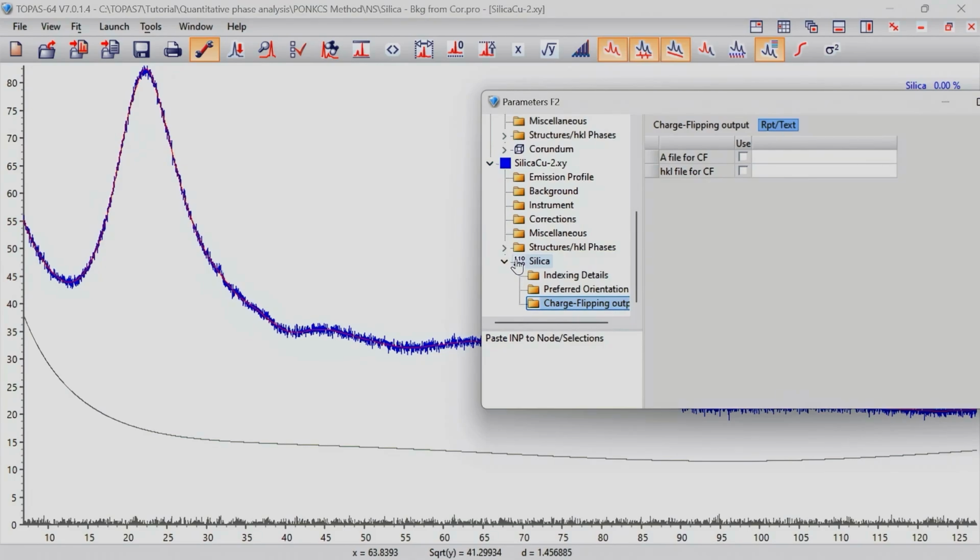Personally, I use only Pawley refinements because they converge much better and faster. The Le Bail method, however, has the advantage that it has no parameter correlation. So sometimes, if you want to determine a good background function, it would make sense to do a Le Bail fit, because intensities are not part of the least squares process, and therefore the intensities will not be correlated with the background parameters.